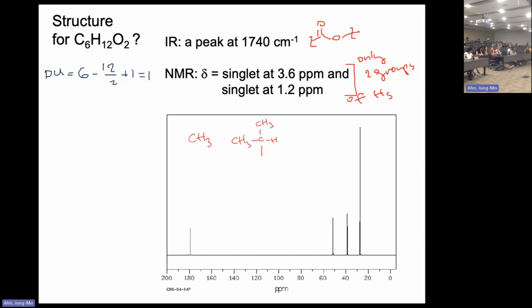If your carbon has 2 methyl groups, these 2 can be identical, but they will be split by the hydrogen on that carbon, so it's not a singlet. That means whatever the carbon is bound to shouldn't have any hydrogens at all. So this is not the situation that gives this, and the number of hydrogens is wrong.